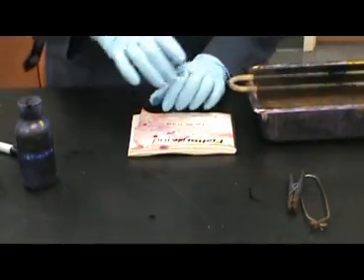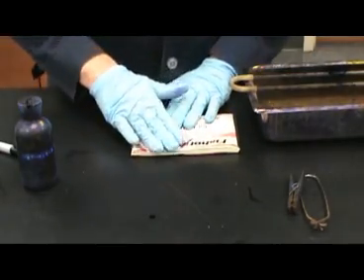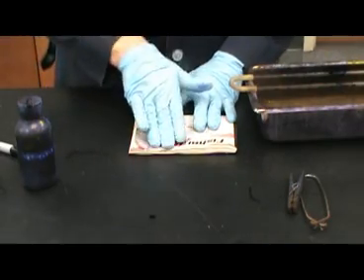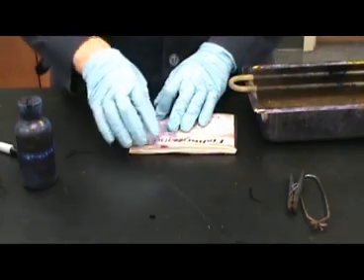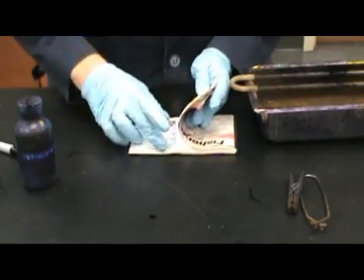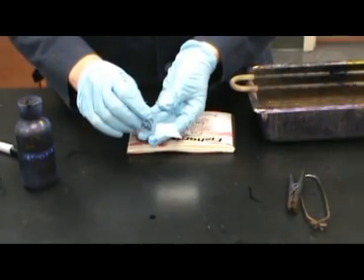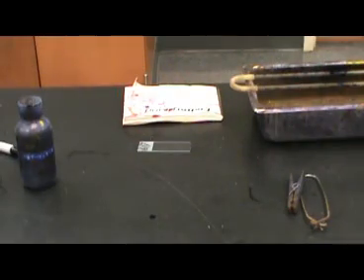You do not want to use a paper towel or tissue paper, since this may wipe the bacteria off of the slide. In this case, you use a book of what is known as bibulous paper. Bibulous paper is used to absorb the water off the slide without disturbing the bacteria that's on it. Simply place the slide in between 2 pages of bibulous paper and gently tap the booklet. Once the slide is dry, it is now ready for observation.